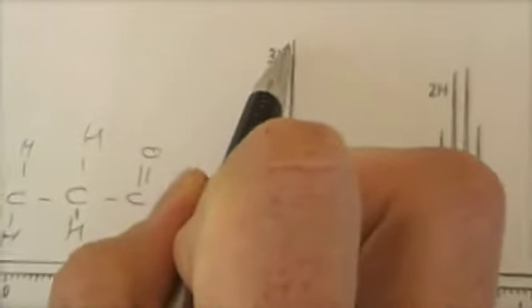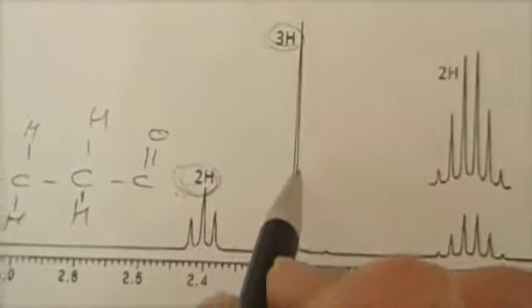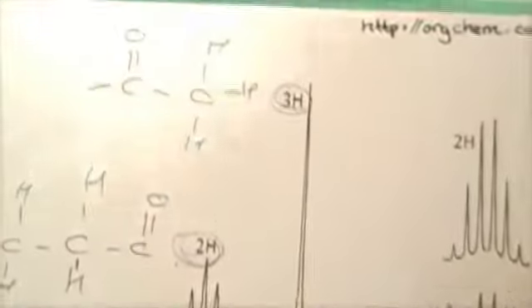Here we see that we've got three identical protons in just a single peak here. So we're going to have a carbon down to three hydrogens with zero neighboring protons. And because it's downfield, we can be confident that that's going to be due to this heteroatom here.